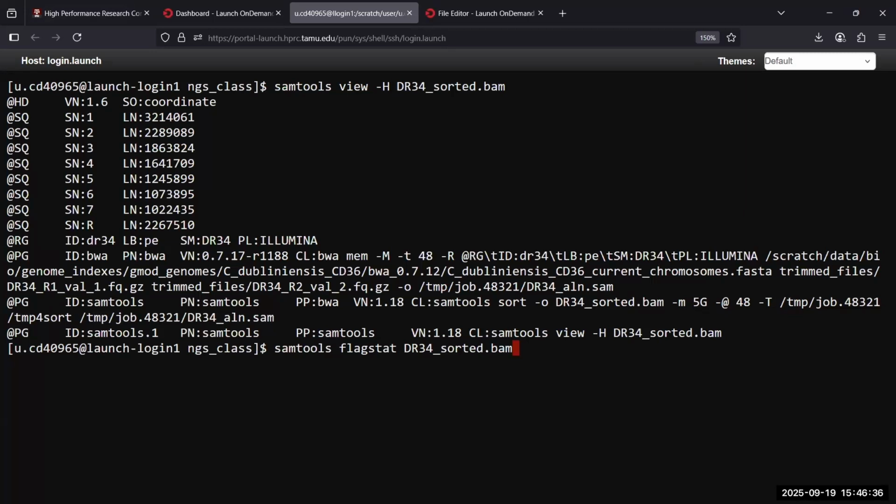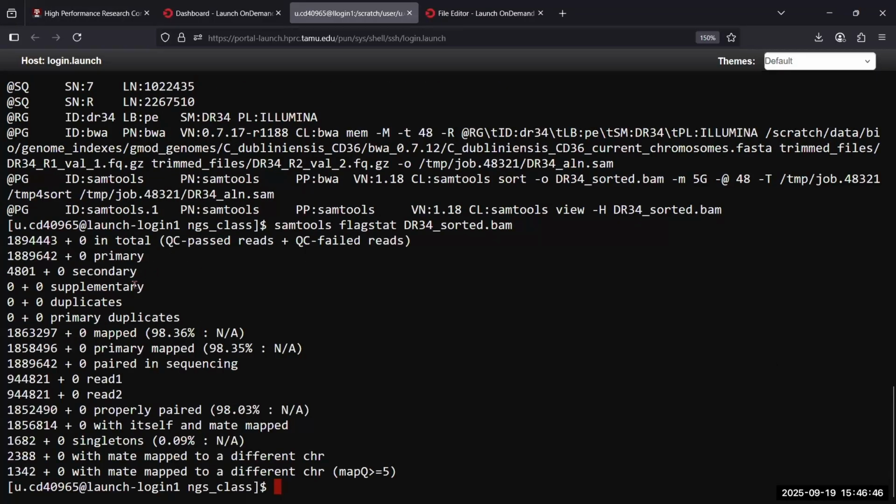You need to make sure you're getting good alignments. We hit enter and let that run. Okay. So look at this, percent mapped. There are two values: the first value and then +0. You see a lot of +0s. That's for a second field in the BAM file. We don't have a quality field, so that's why you see +0. So you look at the first value here.